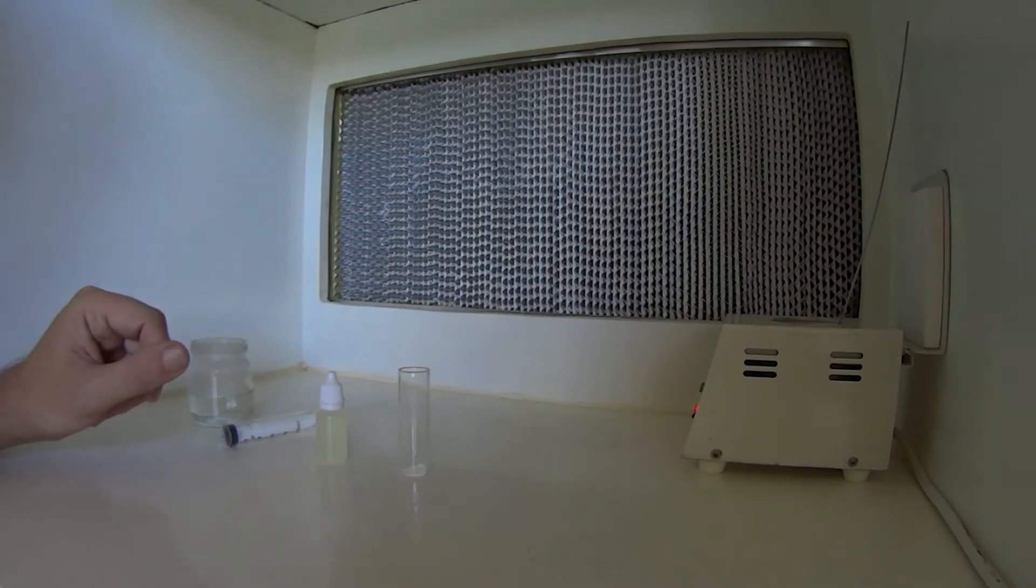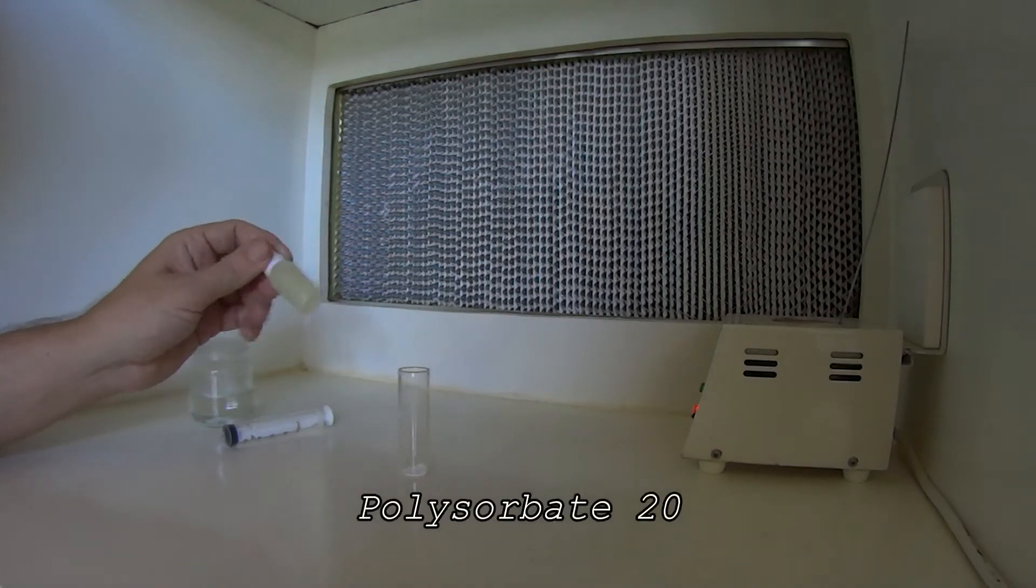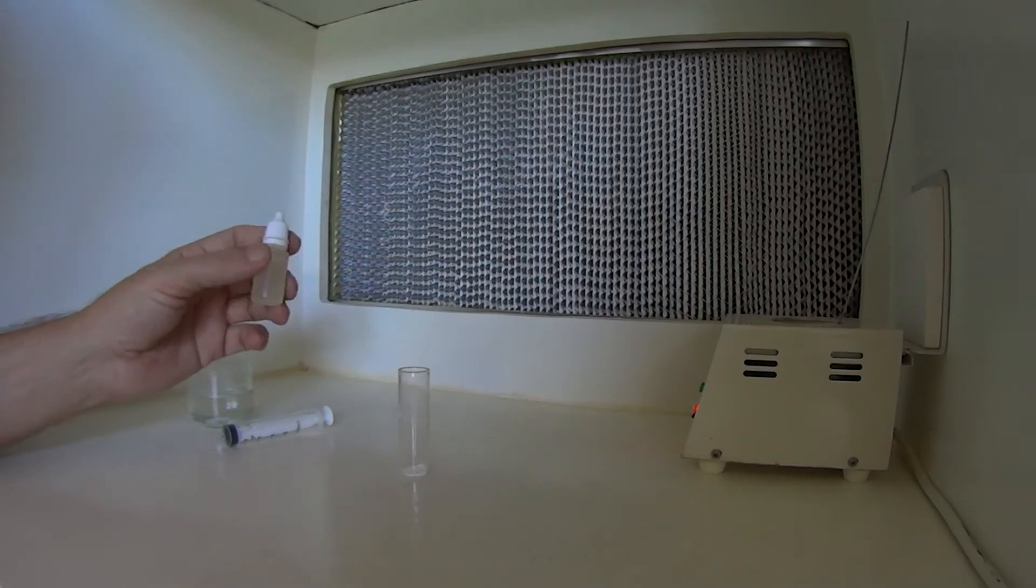So what we use is a product called Polysorbate 20. I'm not going to go into what it is, I'm sure you can Google. Simply we get our measured amount of Tricantanol in a little glass tube or something similar, because it requires heating.